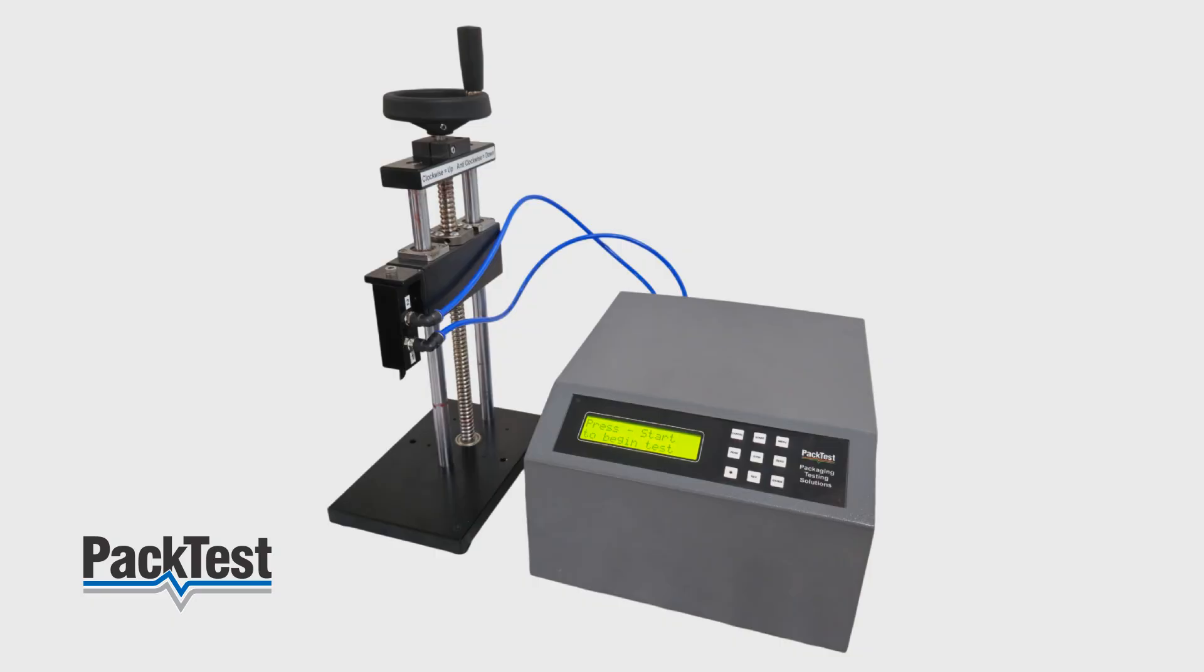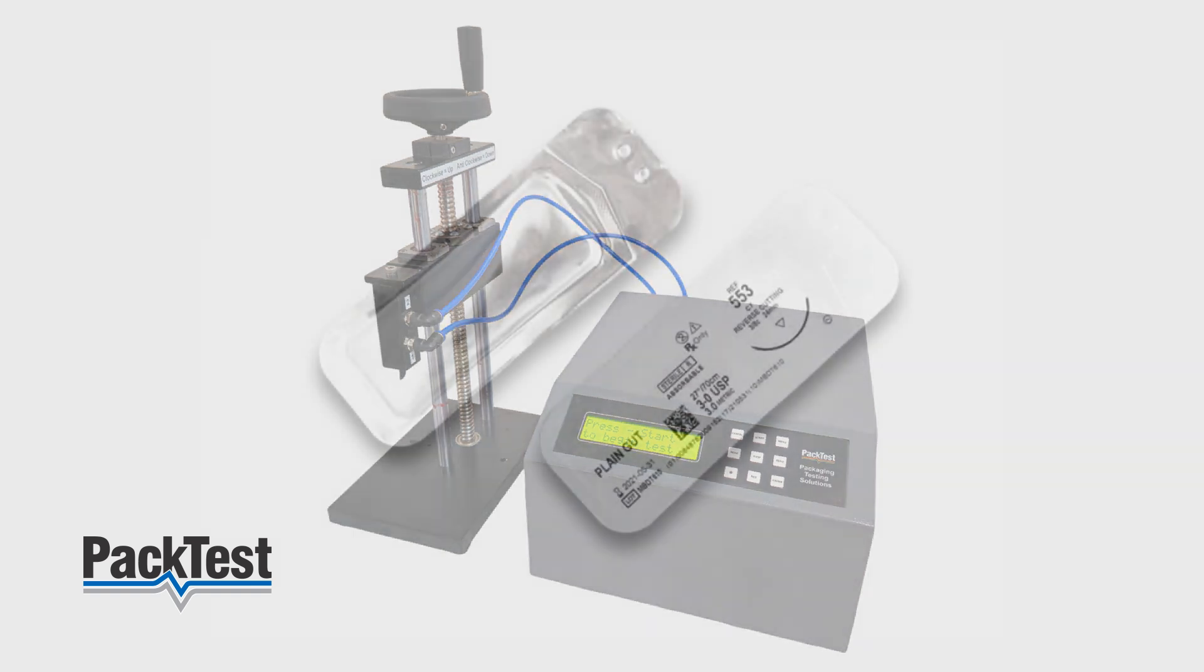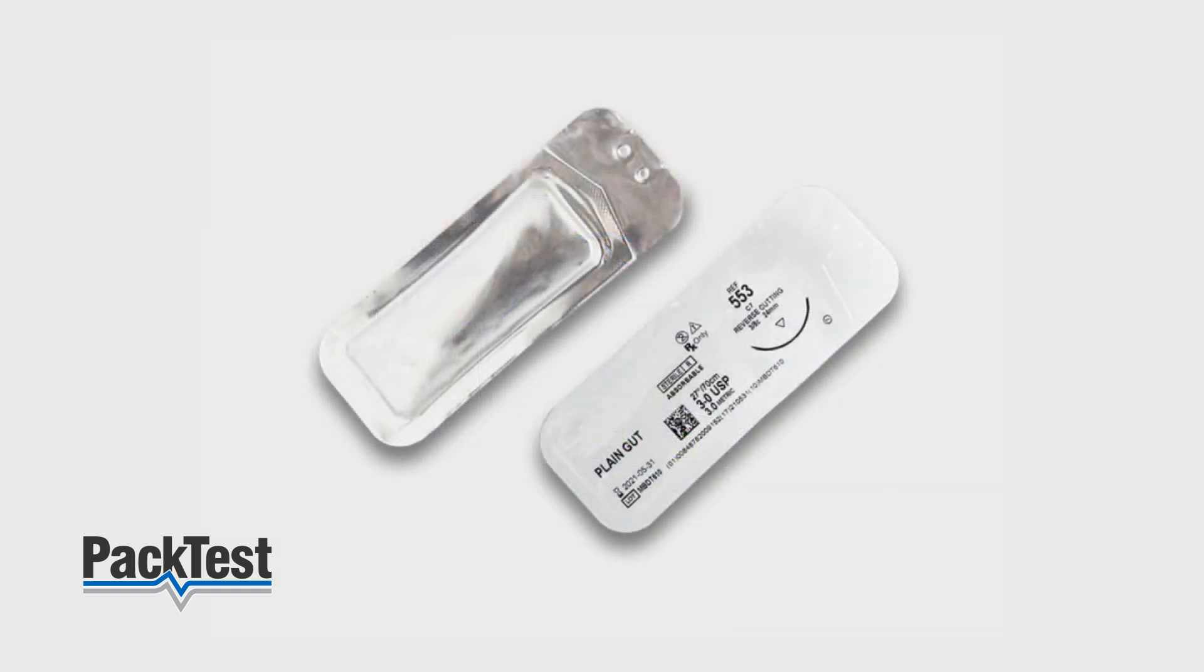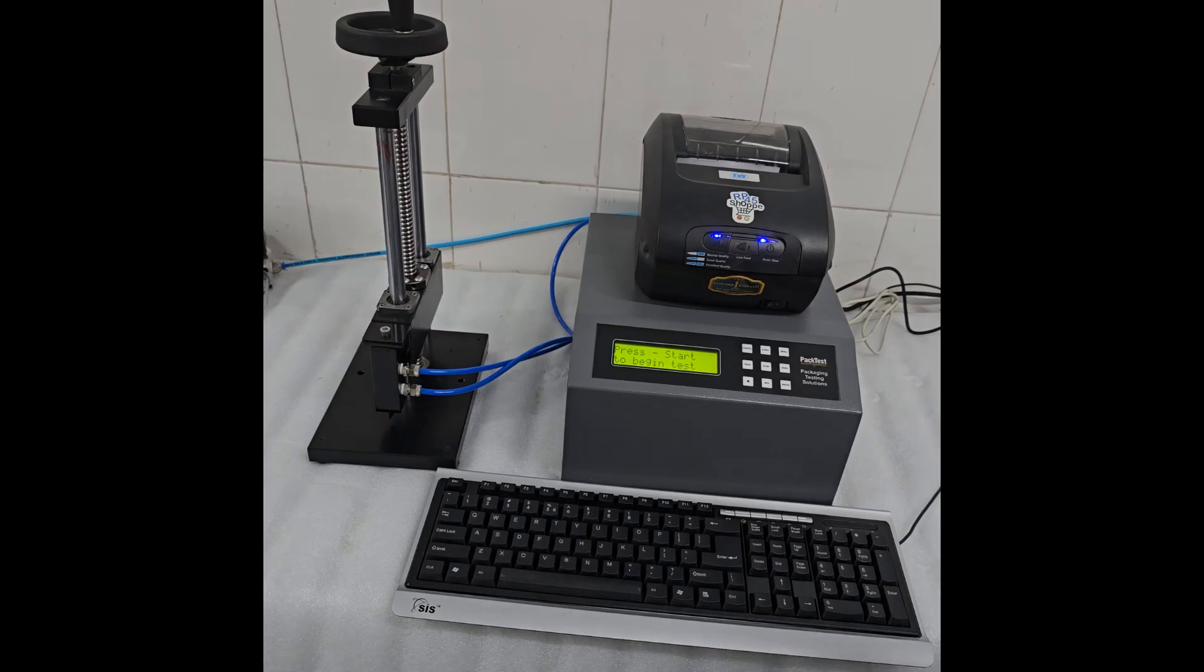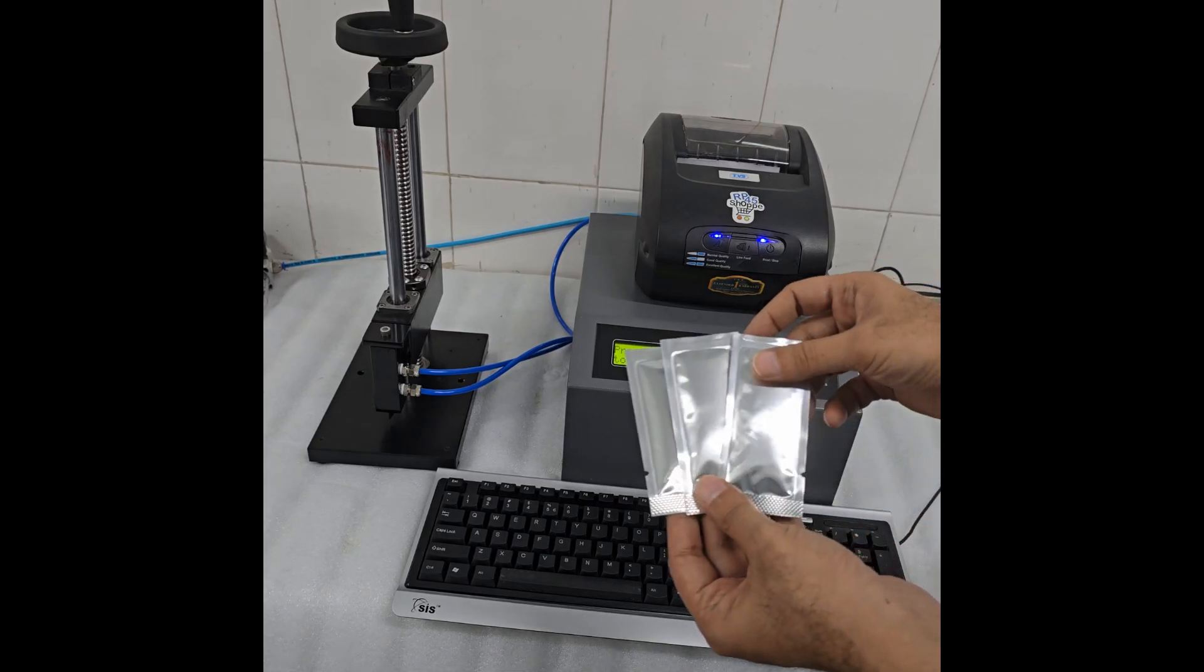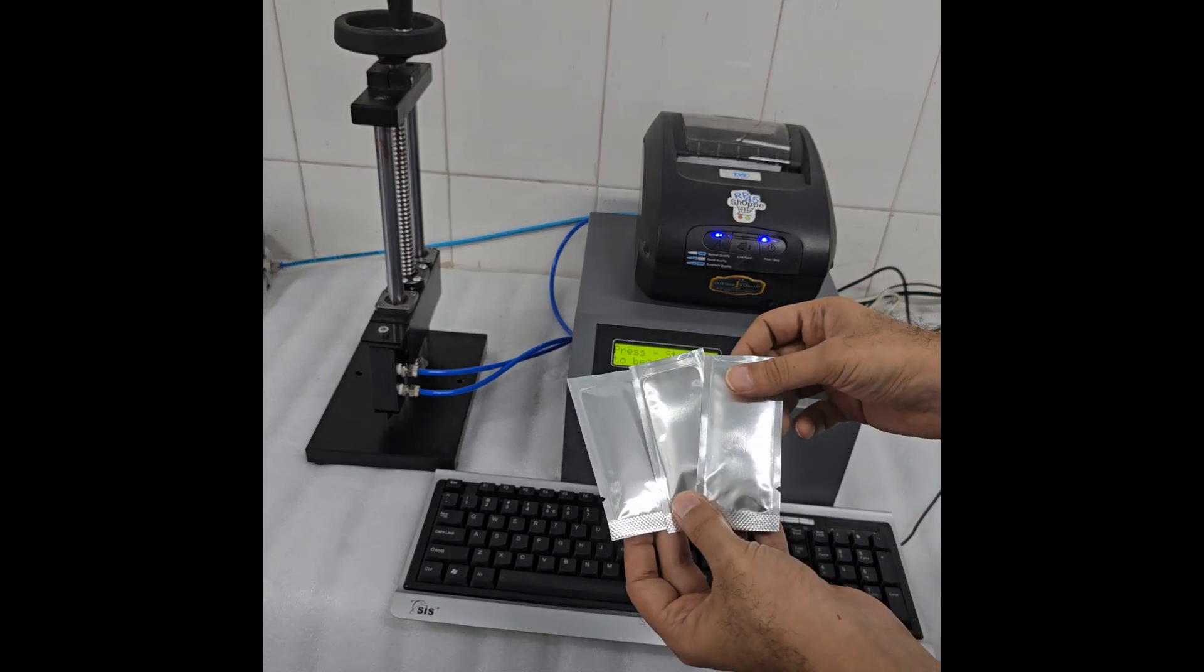You can test a variety of medical device packaging. In this demo, we will be testing the most commonly used form of suture packs, the Aluminum Pouch.